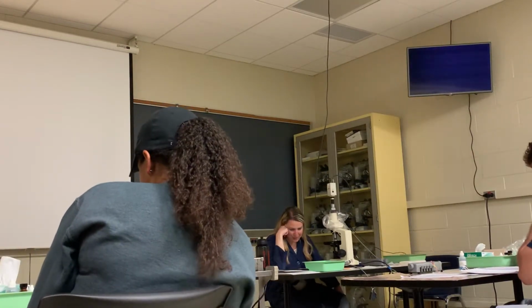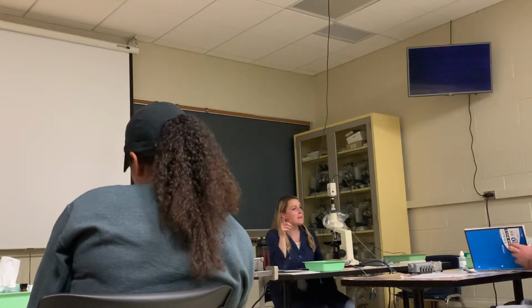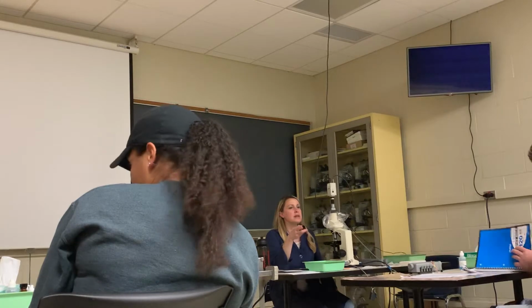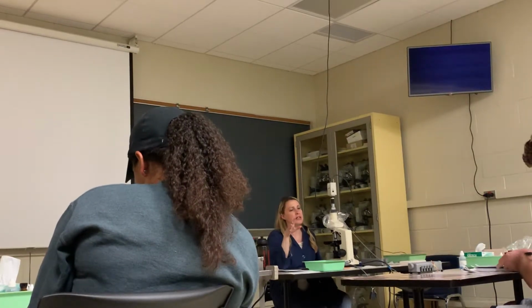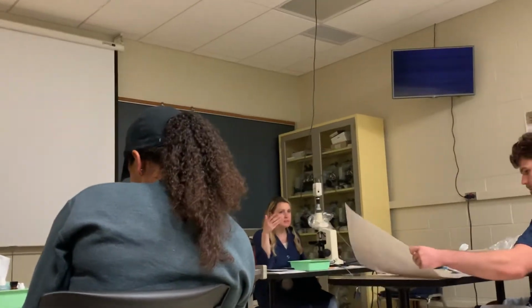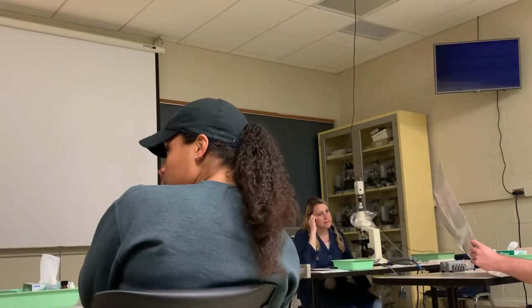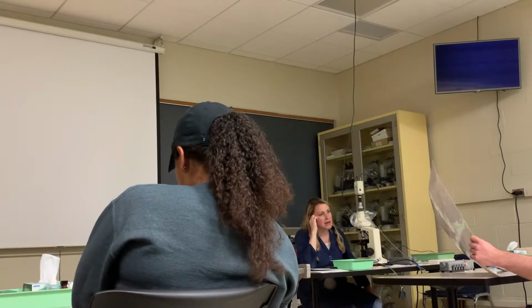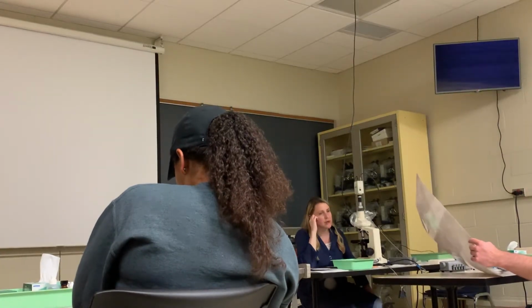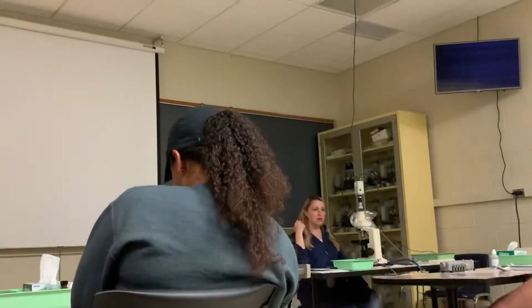All right, so let's see. On your desks, Kim put out some posters for you that you might want to refer to. These are going to be under higher magnification, like I said, than what you're going to be used to, and what you're going to be able to do with your microscopes. But that would be a nice reference for you, because you'll be able to see, as you look at a cell, if you're classifying it correctly.